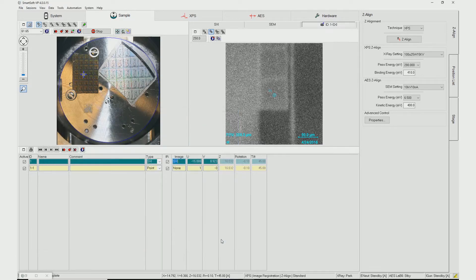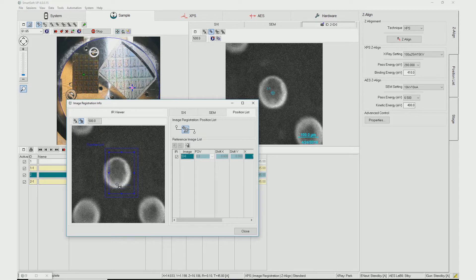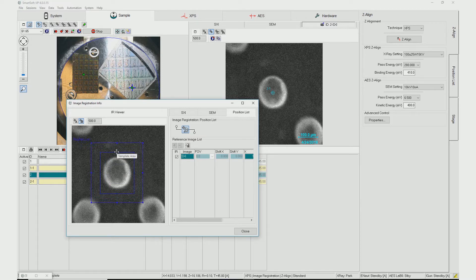Multiple SXI images with different feature shapes and sizes can be set up for Image Registration. This allows for unattended XPS analysis of small features with confidence that the locations of interest are analyzed accurately. SXIs have been acquired on three separate features to highlight the flexibility of the Image Registration software.